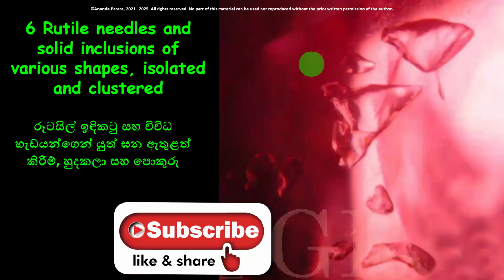What is here? Rutile needles and solid inclusions. Here, these are the rutile needles, and here they are solid inclusions. Various shapes are there. All together clustered. So it gives us the evidence it is natural ruby. Mogok ruby. Burma ruby. Not Mogok, Namya ruby.